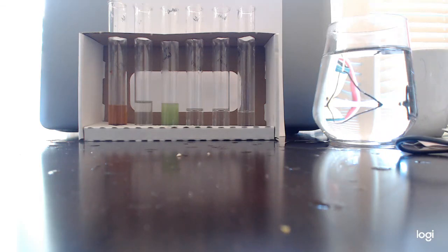I'm going to wrap up this video, and then I'm going to do a set of Sudan 4 tests for lipids, and then that'll be the last of our videos. Hang tight, y'all. Y'all are doing great.